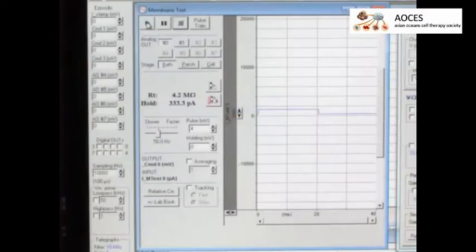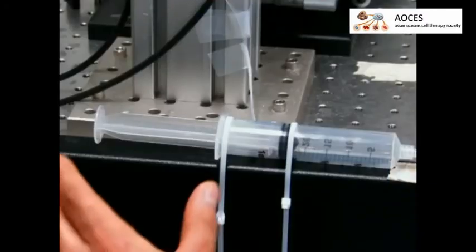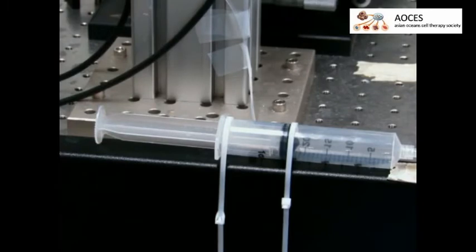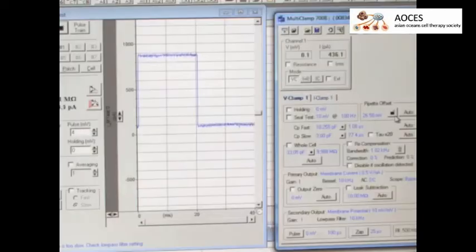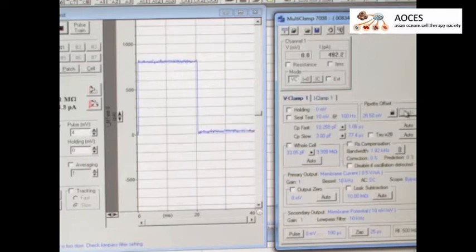In the meantime, measure the micropipette resistance by applying a voltage step. Apply positive pressure in order to remove any air bubbles or other foreign objects blocking the micropipette. After clearing the micropipette, perform a voltage offset to reduce pipette current to zero.